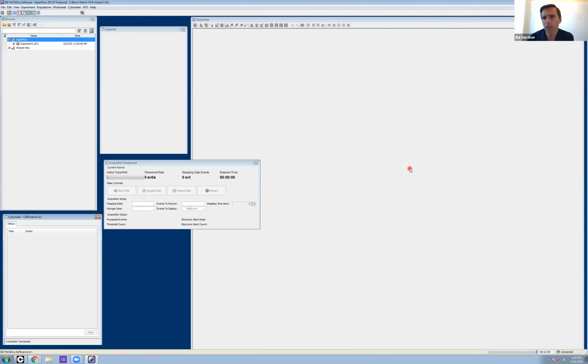But there's a question here also asking, can you also talk about how to load bead info into Diva from the website? We're talking about the lot number, right? Oh, so how to import the specific bead lot information into Diva. Exactly. I think that's a discussion for another day so that we can get into a little bit more of the experiment.